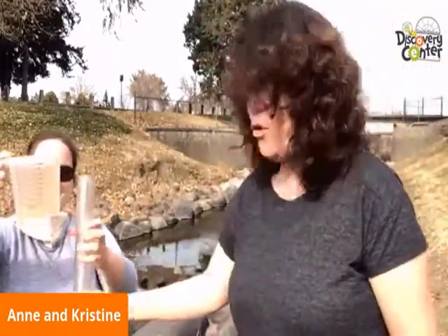So what we're going to do now is we're going to add some water, that Chris went and got earlier, to the T-tube. So I will hold the T-tube while Chris pours it in.